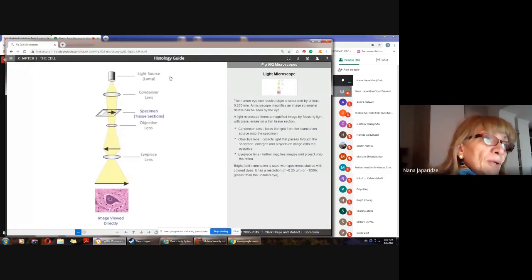When we are preparing tissue samples, first of all, as you know, we have to fix these tissue samples. Immediately when we fix them, what happens with the cells and with the different metabolic pathways in these small tissue samples? Of course, everything is stopped there. The main goal of fixation is to preserve the internal structure of the tissue, the internal structure of the cells.